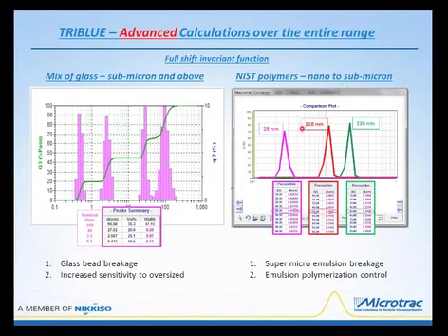So, measuring 28 nanometer, and again, these are certified diameters by NIST procedures. This is purchased material. This is 28 nanometers, 110 nanometers, and 220 nanometers. And this is on the other side. Over here, we were talking about particles going up in size. Now we're talking about particles going down in size.